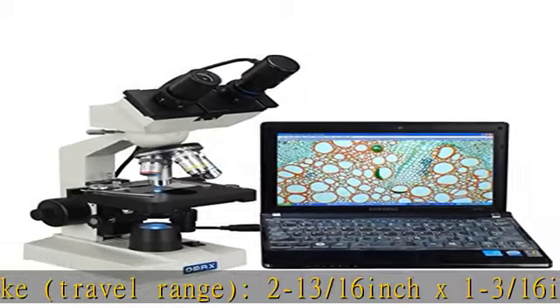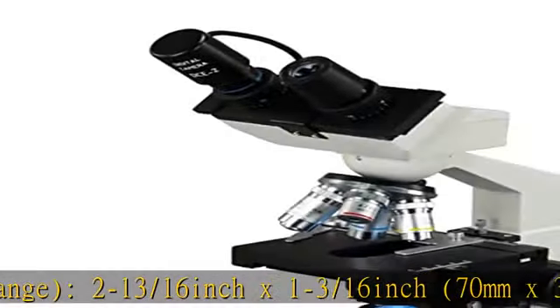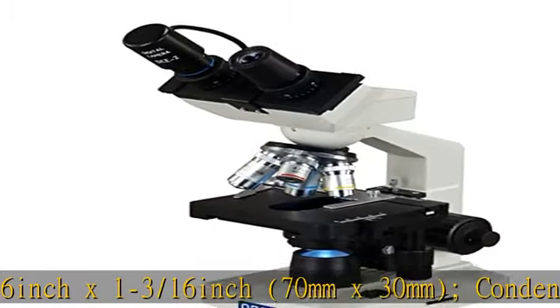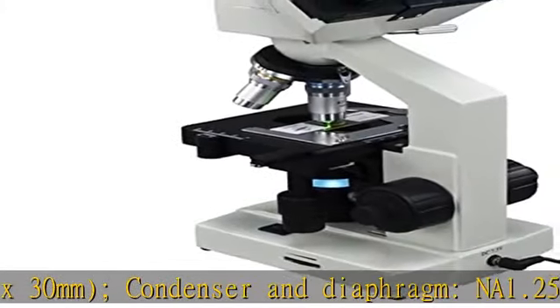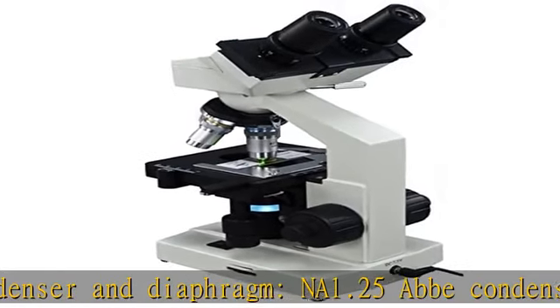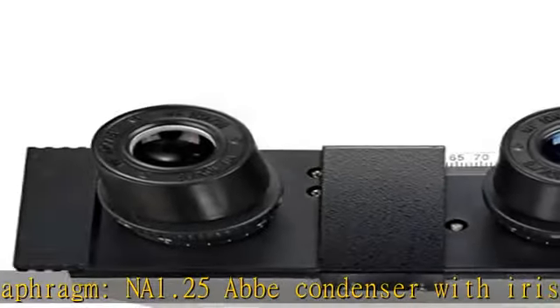Focus adjustment: coaxial coarse and fine knobs on both sides. All metal mechanical components. Power supply: AC-DC adapter 7.5V/7.5W, all approved.